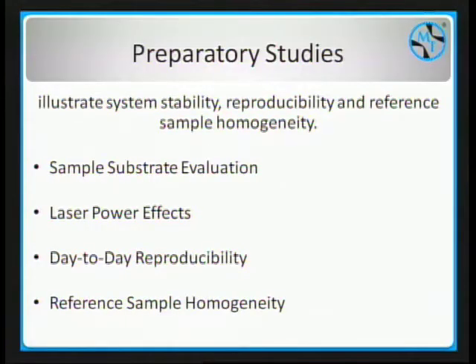So our preparatory studies, we looked at sample substrates when you put your sample on different substrates. We looked at laser power effects.